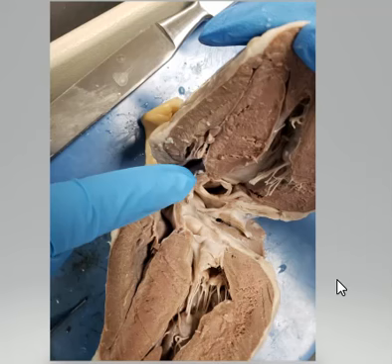This is Brother Barnes. We're going to keep going over the sheep heart until we get it right. I'm going to call this sheep heart mock practical B. When I look at this heart, the first thing I look for is the interventricular septum. Then I try to compare the two widths of the ventricles. The smaller width will be the right ventricle, and the larger width will be the left ventricle.